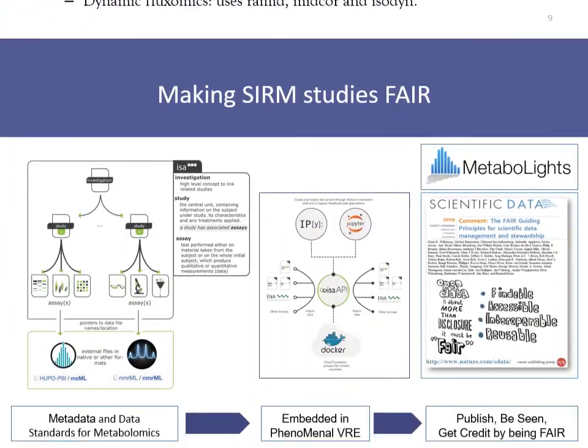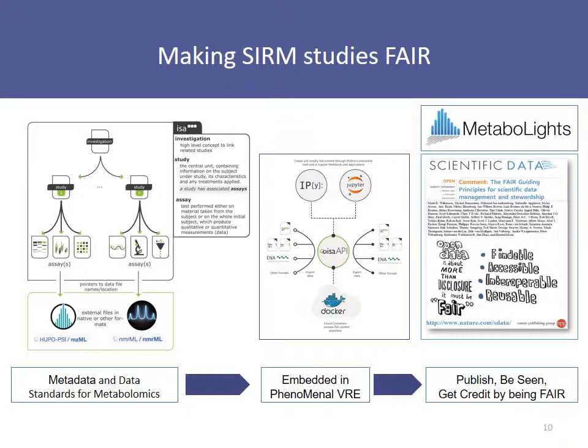An important remark about standards. Stable isotope-resolved metabolomics experiments are labor-intensive and sensitive to experimental deviations. Care must be taken recording experimental conditions and results according to regularized standard formats, so comparison between experiments may be considered. Standards are essential tools in the process of information, communication, publication, and preservation. They ensure data are findable, accessible, interoperable, and reusable. In short, it is about making data FAIR.